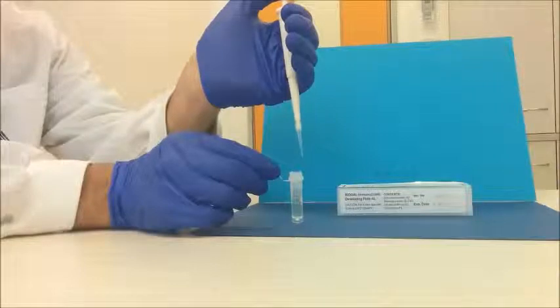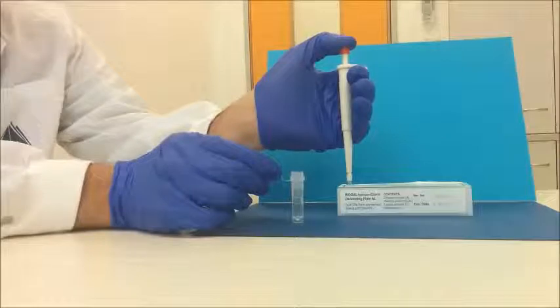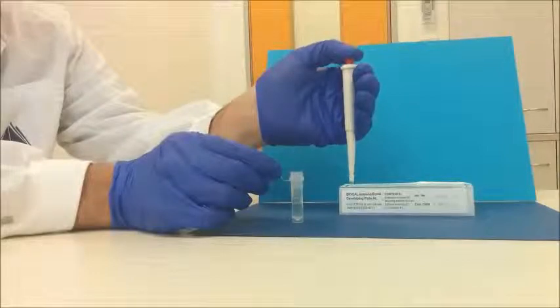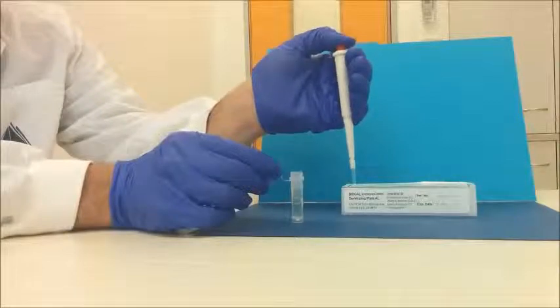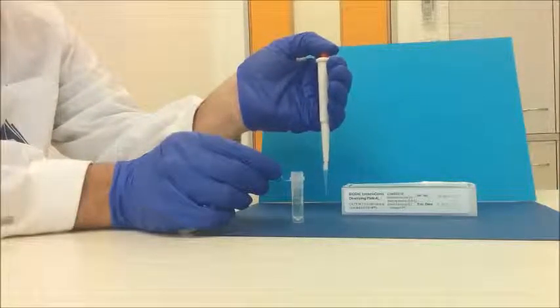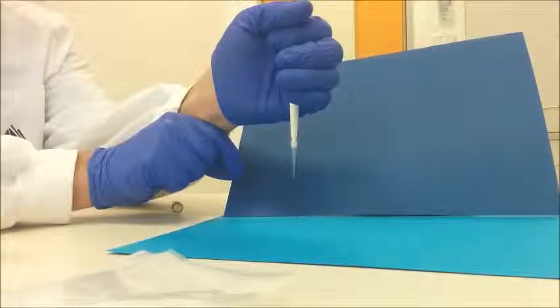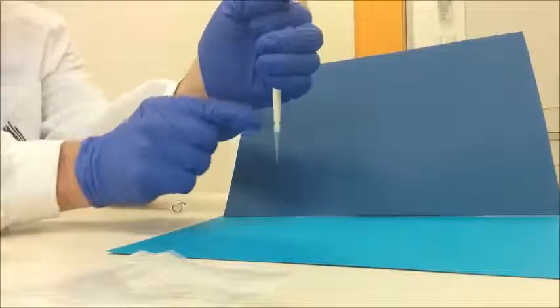Dispense the liquid into the receiving vessel by gently pressing the operating button to the first stop. After a second, press the operation button to the second stop — this will empty the tip completely. Remove the pipette from the vessel, sliding it up the wall of the vessel. Release the operation button to the ready position. Remove the tip once it has finished being used and dispose of correctly.